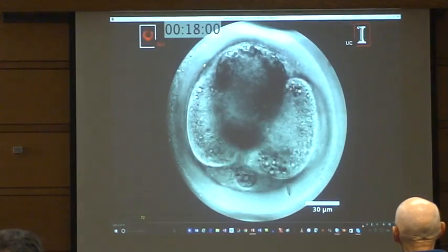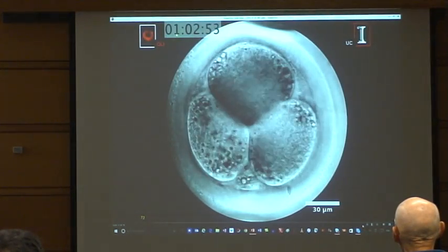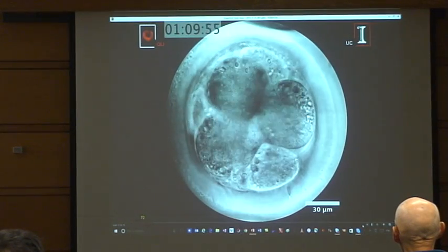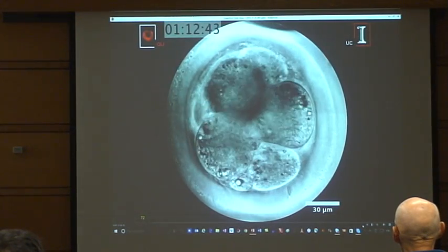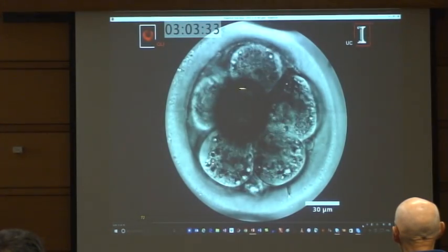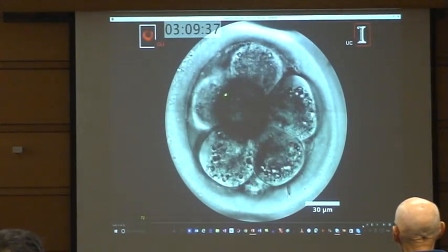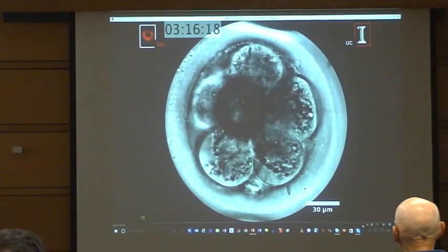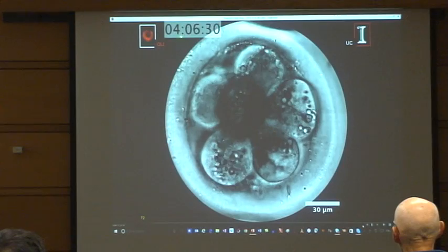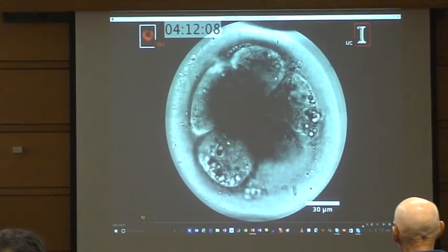So here's a version where these are hours, and now these are days. So we ran an experiment with this with 60 different embryos over a whole week, 18 terabytes. So we are sifting through all this data. So notice what happens, the sad thing here. This thing is unhappy at some point. Right about now. Boom.